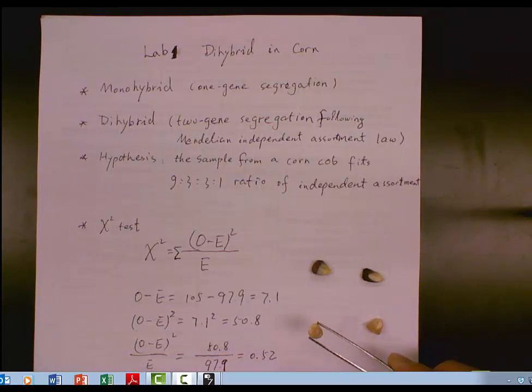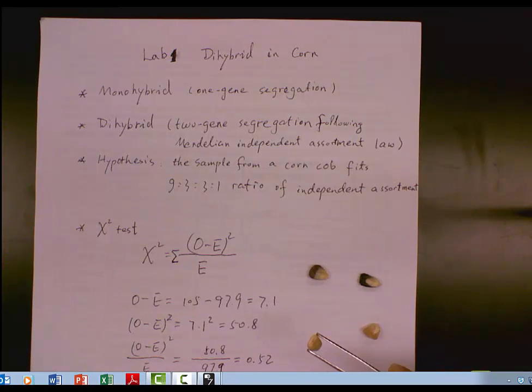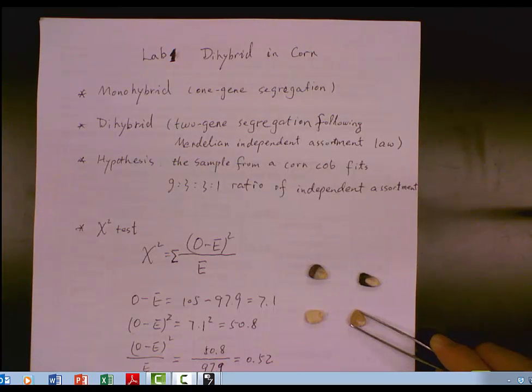And the third one is colorless. And the dent we see is happening at the top, the colorless. The fourth one is colorless and shrinking. The kernel collapses at four sides and at the top called shrinking. This is colorless.